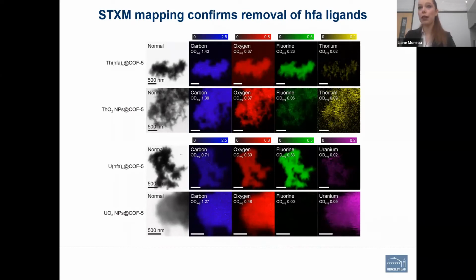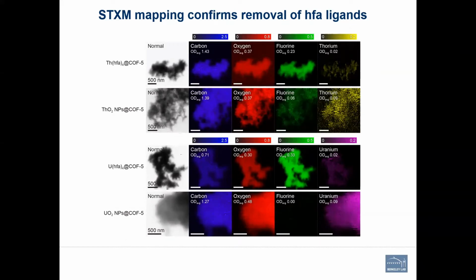In particular, in the SI of the paper, we do show the fluorine data from the XAS that was taken in conjunction with STXM. And from interpretation of that, it did not appear that there was really incorporation of the fluorine inside of the particles. Thank you. Another quick question, if there is time.